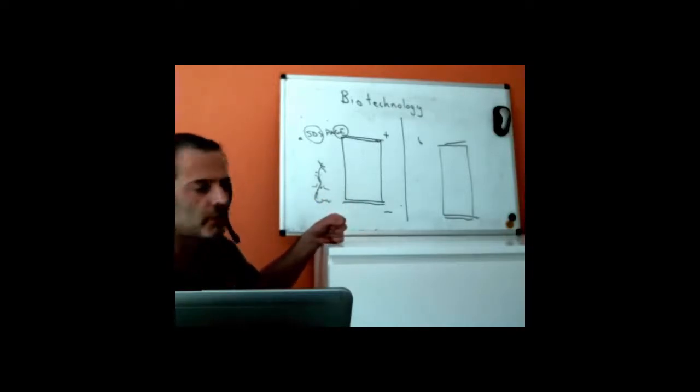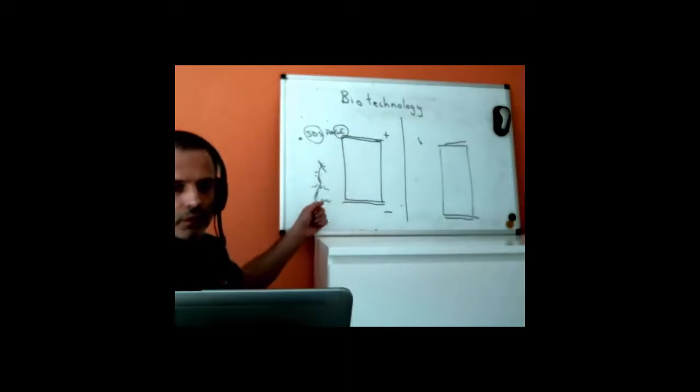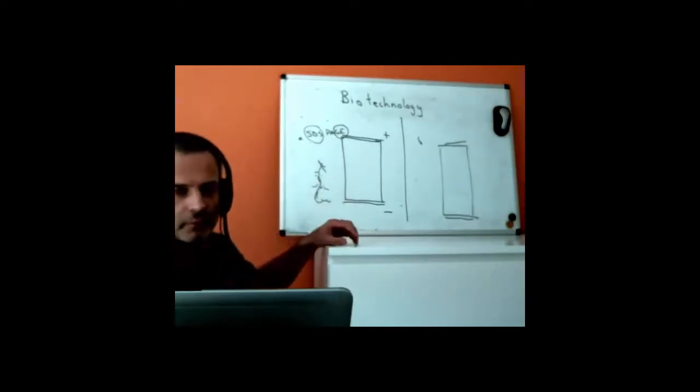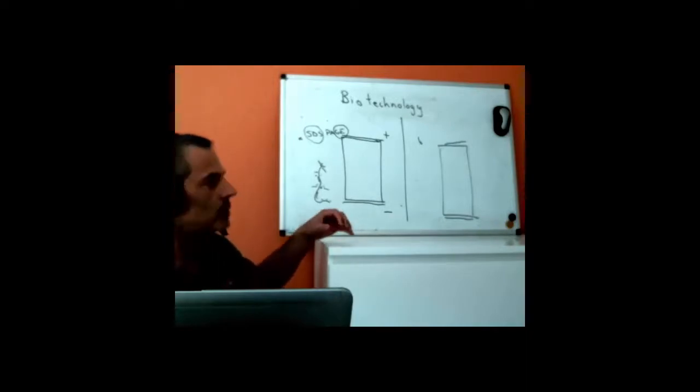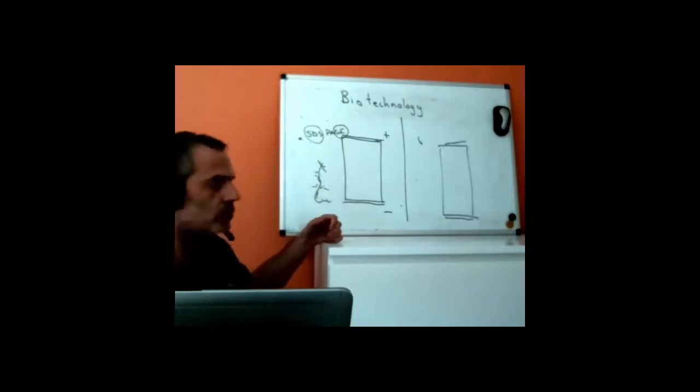There is a problem, however. The soap will tend to denature the protein molecule and cause it to open out, which I've drawn like that. That's good because we want to measure the length of the protein molecule. It's bad because we won't be getting it back in any functional form, not very easily anyway.